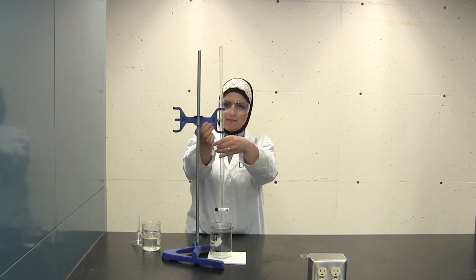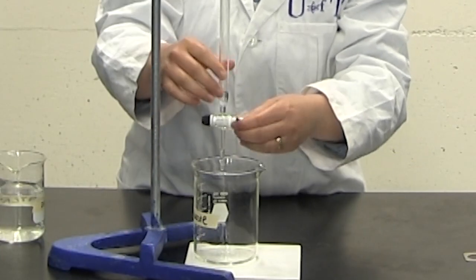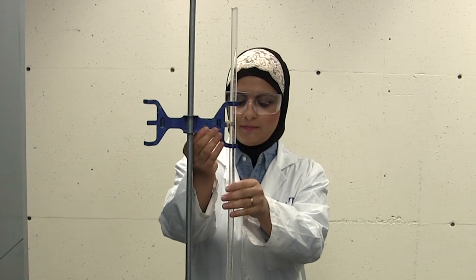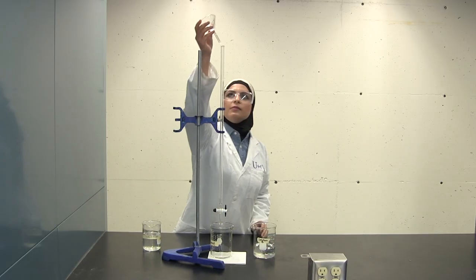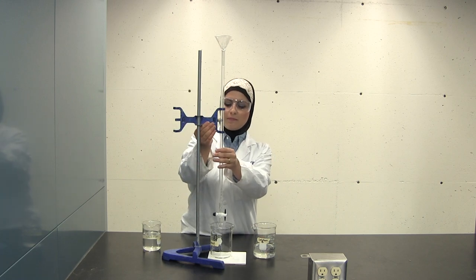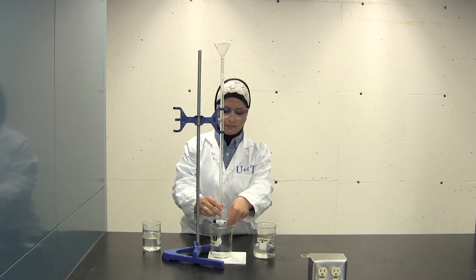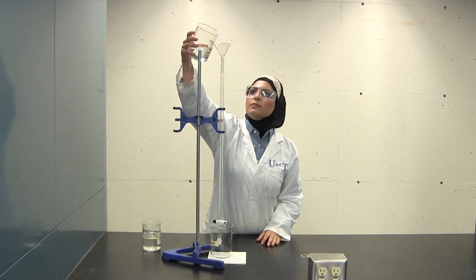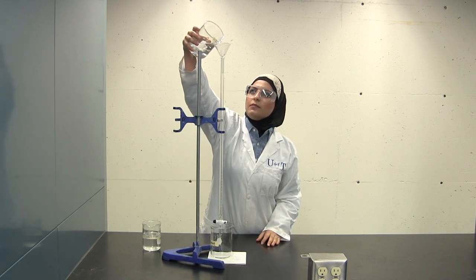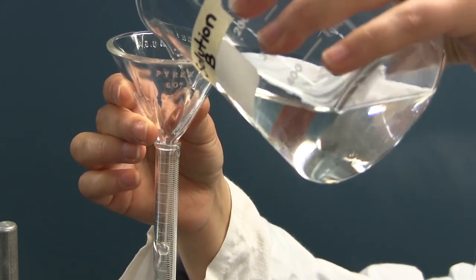At this point, before filling up the burette with your titrant, make sure that the stopcock is closed. Once the burette has been rinsed with the titrant, clamp the burette and ensure that it is vertical. You are now ready to fill the burette with the same titrant. Using the short stem funnel, fill the burette from the top with the solution close to the top of the burette. You may need to lift up the funnel slightly to allow the solution to flow in freely.